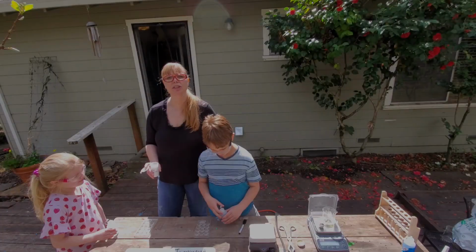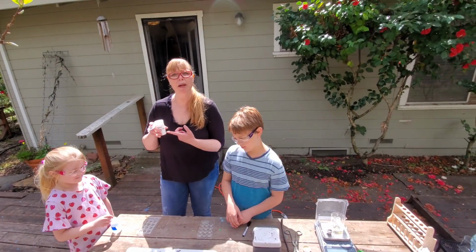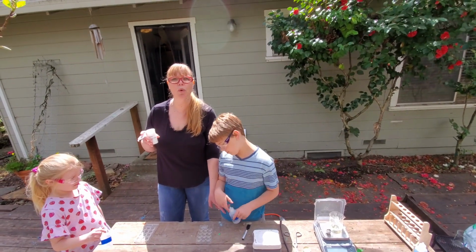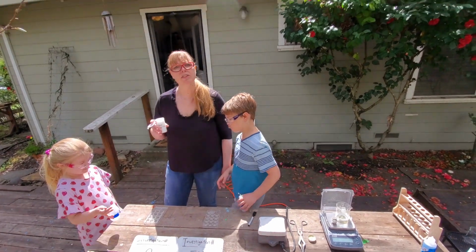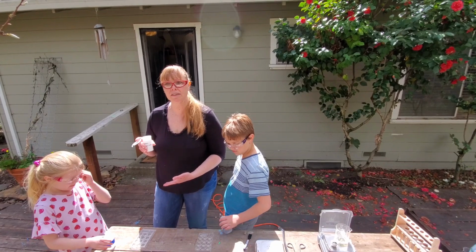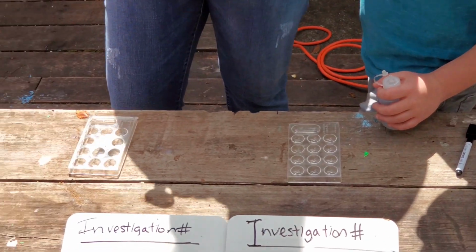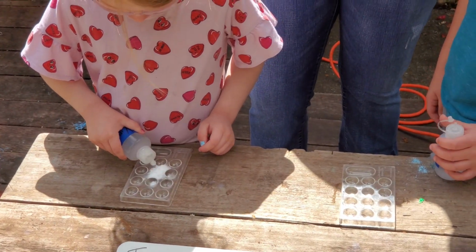That's number 8. We're going to do investigation 9 and 10 together. What we have here is baking soda powder, and then Troy has baking soda solution. That means water's added and it's watered down. Jules got vinegar. So again, physical, chemical, and appearance, qualitative stuff. So let's go ahead and do some powder there. Jewel, go ahead and put the vinegar on top of it. Just squirt it all over.